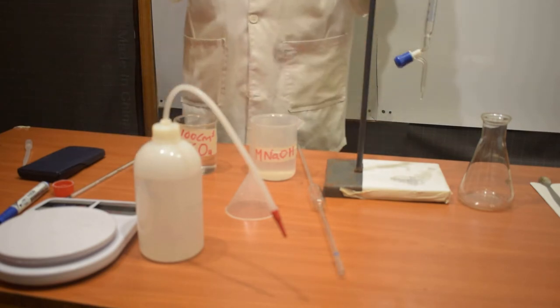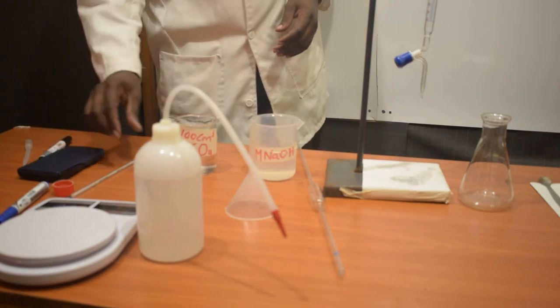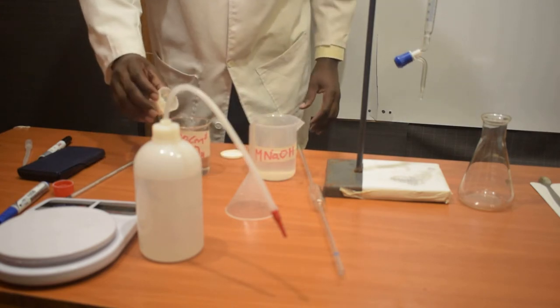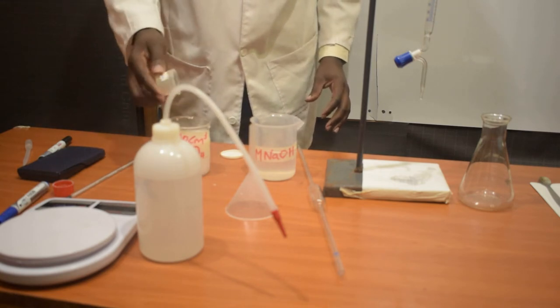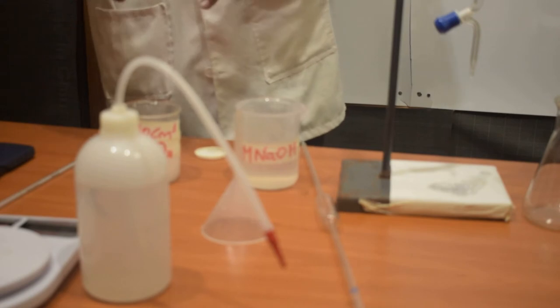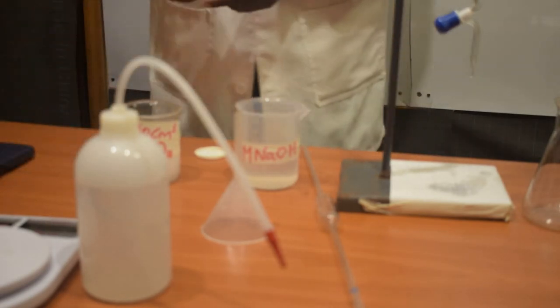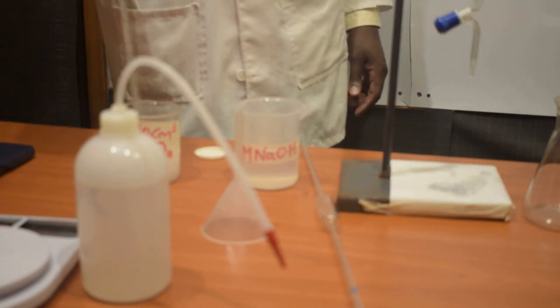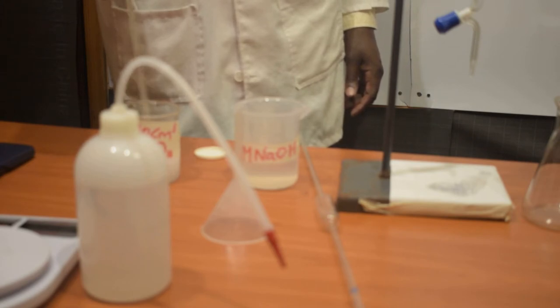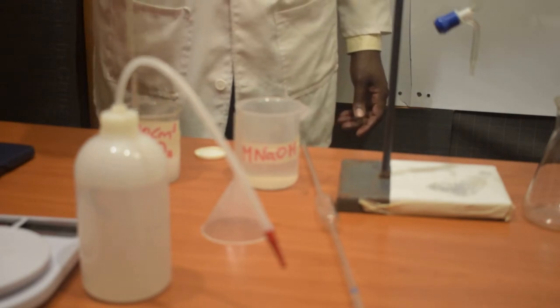So the procedure is this. I'm going to put all the 5 grams of sodium carbonate in my sulfuric acid. Effervescence occurs due to production of carbon dioxide. Now, when the effervescence stops, this will indicate that all the sodium carbonate has reacted, and what will be left here is the excess sulfuric acid.